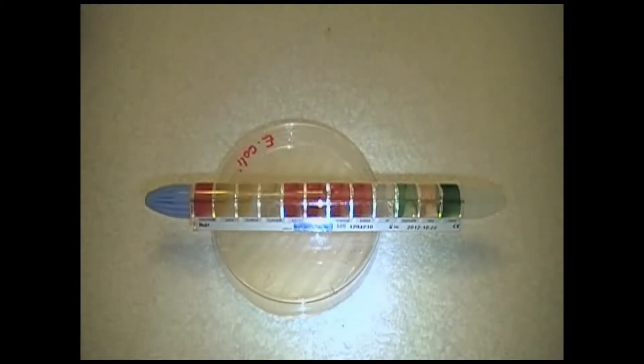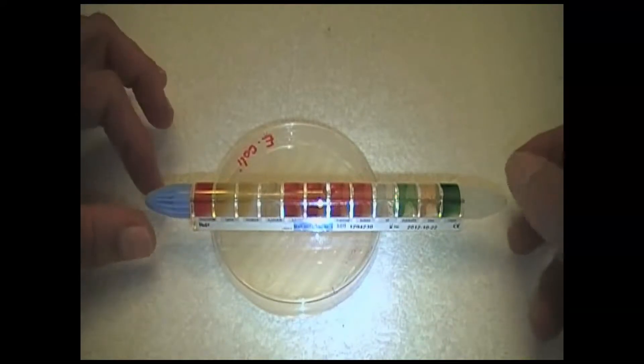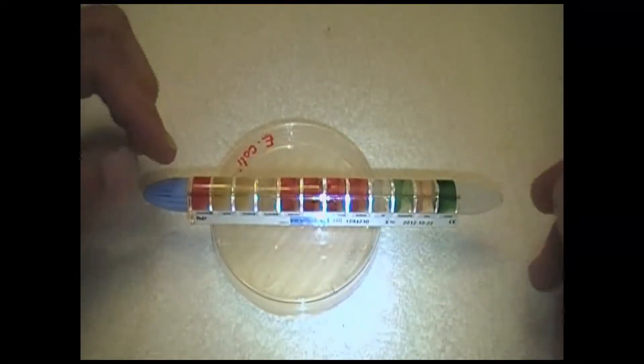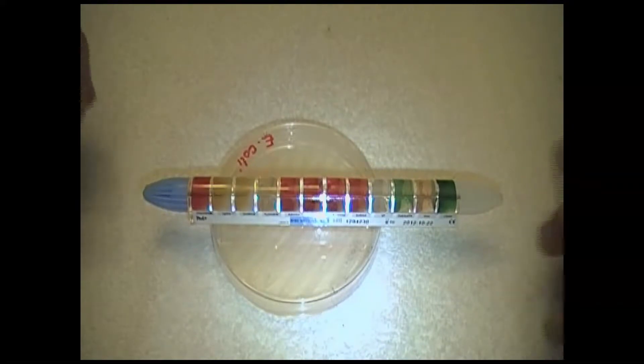We are going to look at the process of inoculating an entero tube. We have two things in front of us: the entero tube, which is 12 compartments that have various biological tests in them.